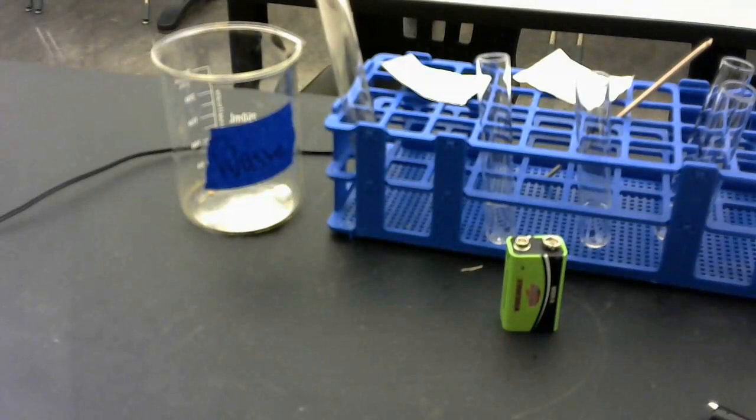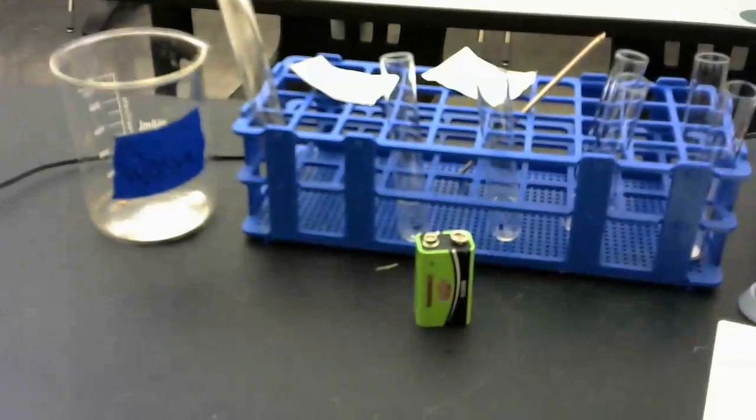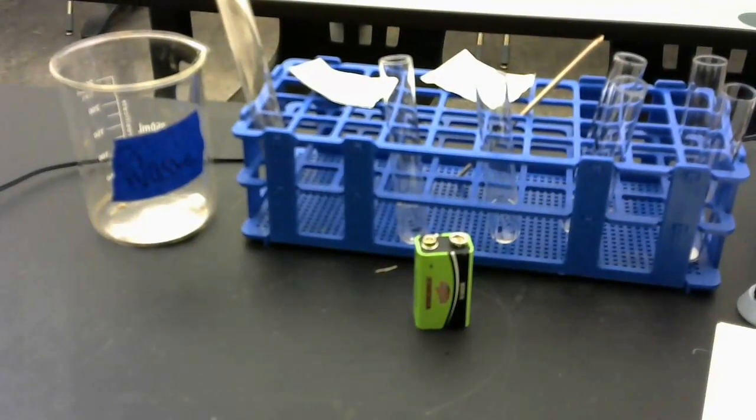Okay, I'm going to move my water aside and my alligator clips aside because I no longer need those. Okay, now I'm going to move on to reaction type C. Make sure that as you're going along on your document, you are balancing your equations, writing your word equations, and you are writing down your observations. Okay, so this next reaction is actually probably one of my favorite ones. This is reaction type C and reaction type C number 1.